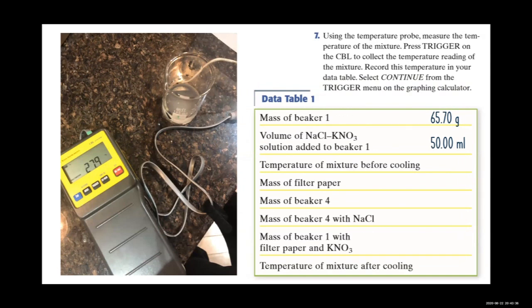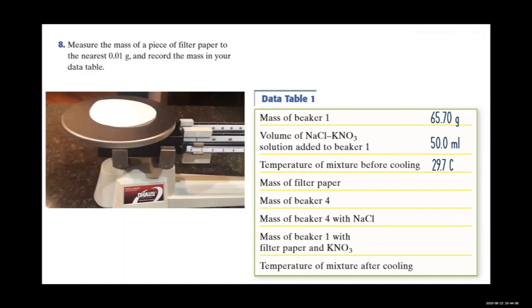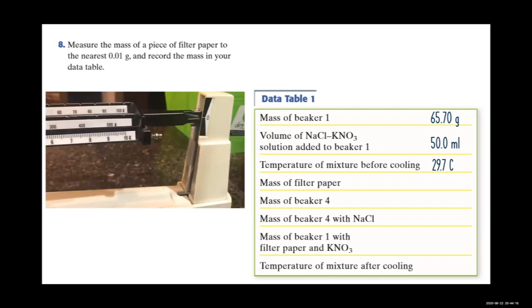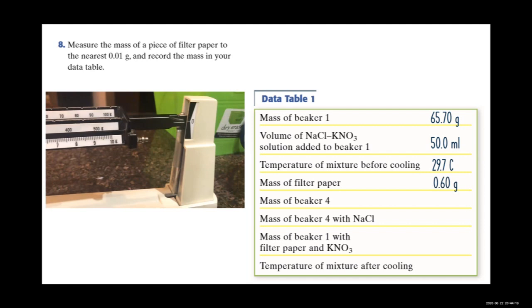Using the temperature probe, measure the temperature of the mixture. Our temperature before cooling was 29.7°C, which is a little warmer than room temperature — likely because the solution had just been made. Measure the mass of a piece of filter paper to the nearest 0.01 gram and record it. Our filter paper was 0.60 grams.